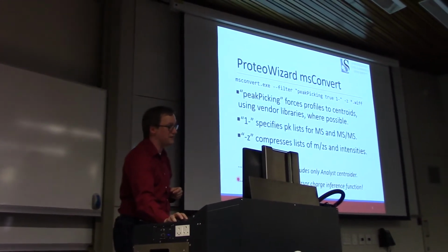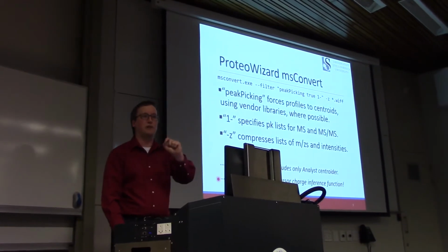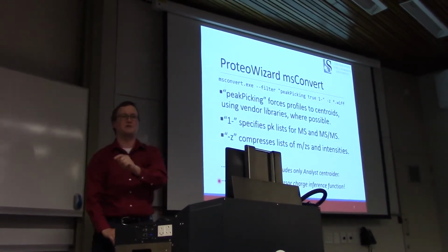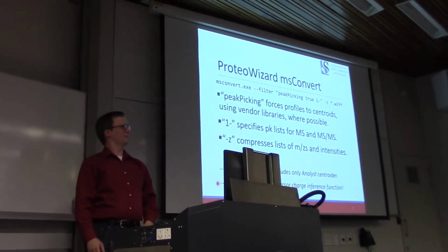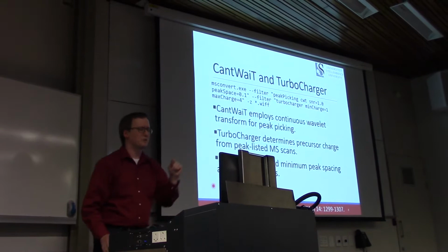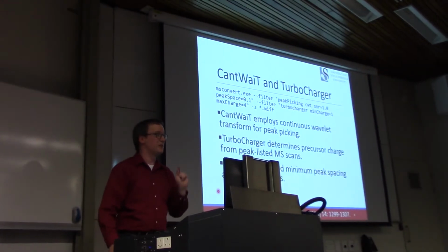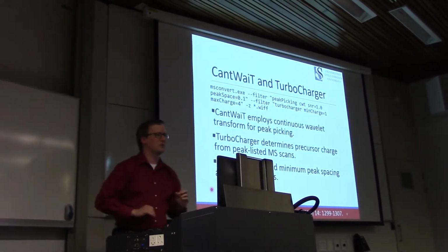The other thing that I find very difficult to deal with is that they never provided a library, in this set of tools made available to ProteoWizard, that lets us determine the precursor charge for each tandem mass spectrum. Isn't that odd? Well, we'll get to that in one slide. I'm now giving you a much, much more complex command line for running MS-Convert, but it's the one that I'm going to be comparing everything to, so I want you to just stay with me.